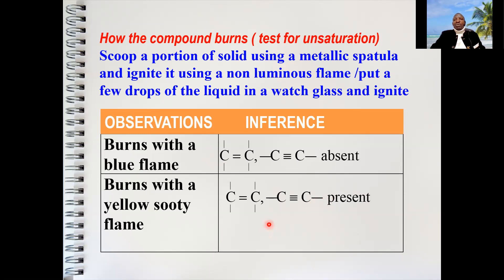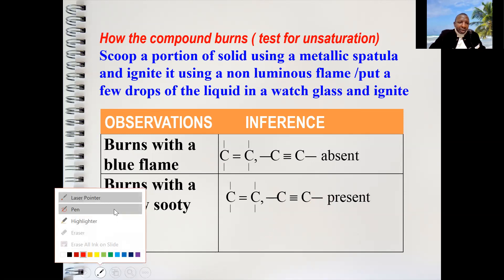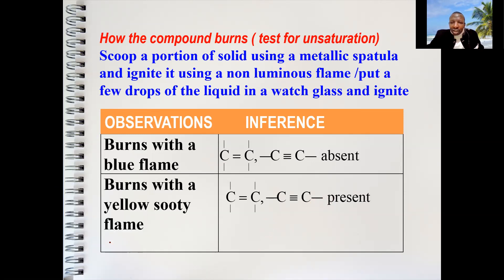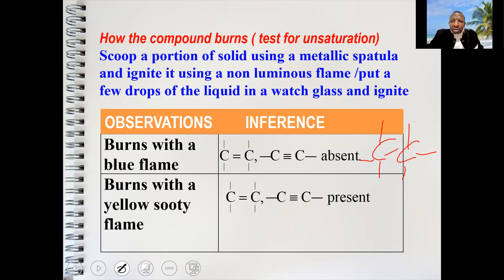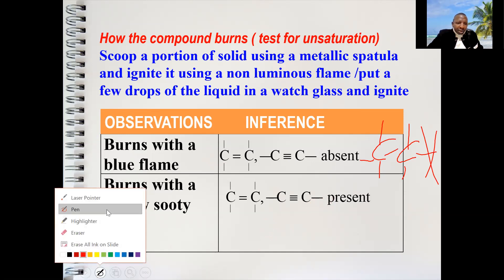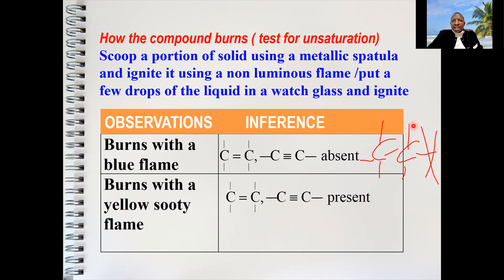Remember, in organic qualitative analysis we are testing for functional groups. Alkanes have no functional groups, so it is wrong to write 'single bond present' — we don't test for single bond. If it burns with a blue flame: double bond, triple bond absent. If it burns with a yellow sooty flame: double bond, triple bond present. It is wrong to write 'alkane present,' 'ROH present,' or 'alkanol present' as the inference here.